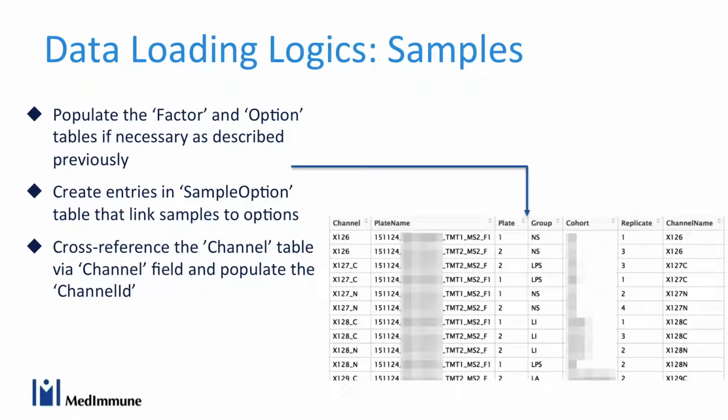And then we designed a logic, saying, okay, if you take the output from the ProteomeDiscoverer that already has the sample relationship built, and we have the protein ID, the peptide ID, the protein intensity, etc. With our user team together, we designed a set of logic for how we parse these data files and then load them into the tables that we set up inside LabKey.